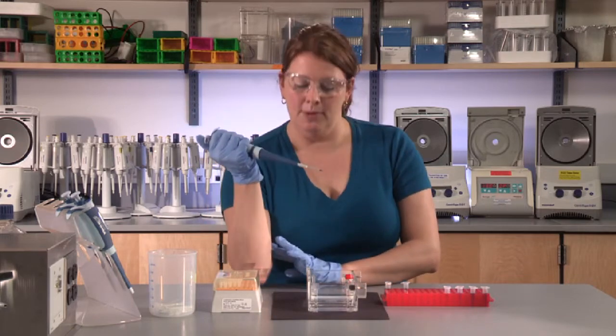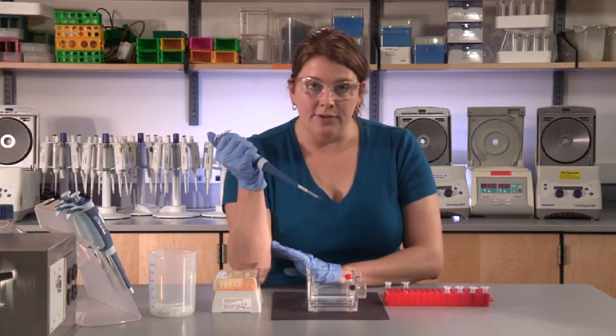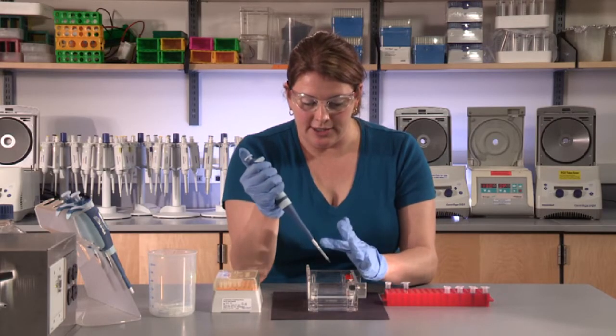Sometimes it's helpful to put your elbow on the table to steady yourself. Get the lane in view that you would like to load. You can use your other hand to steady yourself.